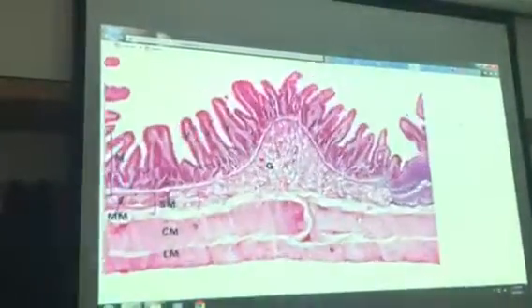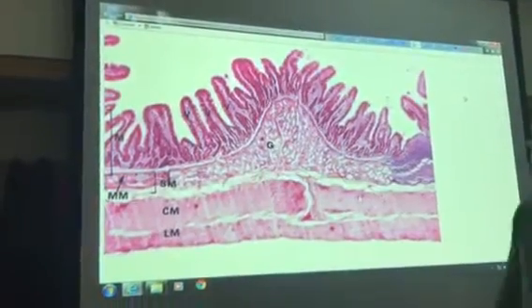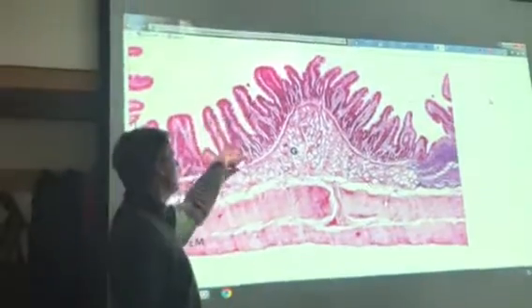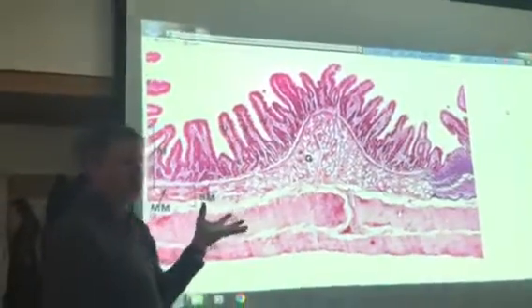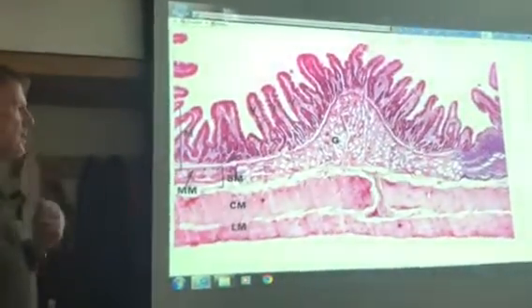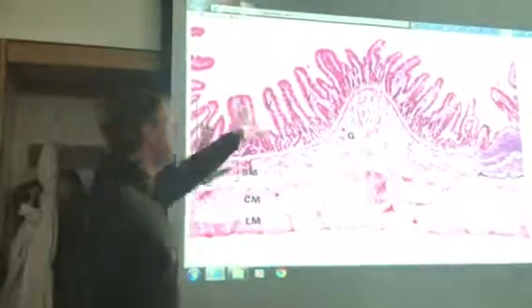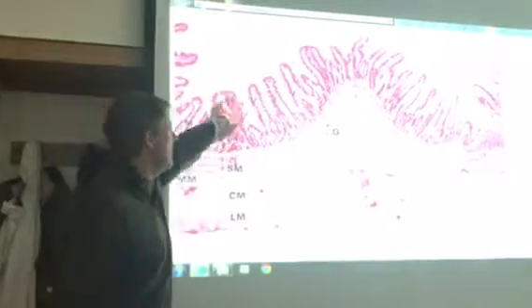This is the small intestine. Specifically, this is the duodenum. It sort of looks like the stomach at first. The only thing I can tell you is look at the projections. They're more finger-like when you're in the duodenum. They don't compare to the gastric pits and the gastric glands. These things look more finger-like. The V up there is for villi.